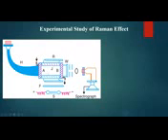When light falls on the liquid, light gets scattered. That scattered light passes through this window, which is perpendicular to the incident light. So scattered light is studied perpendicular to the incident light, to avoid the intensity of the incident light. Otherwise, you cannot observe the scattered light properly. The intensity of incident light is much higher compared to the intensity of scattered light.